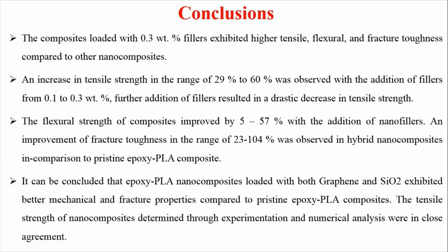And finally, the conclusions: an increase in the tensile strength, flexural strength and fracture toughness was observed with the addition of fillers from 0.1 to 0.3 weight%, and an increase in tensile strength of 29 to 60%, an increase in flexural strength by 5 to 57%, and an increase in the fracture toughness by 23 to 104% was observed.